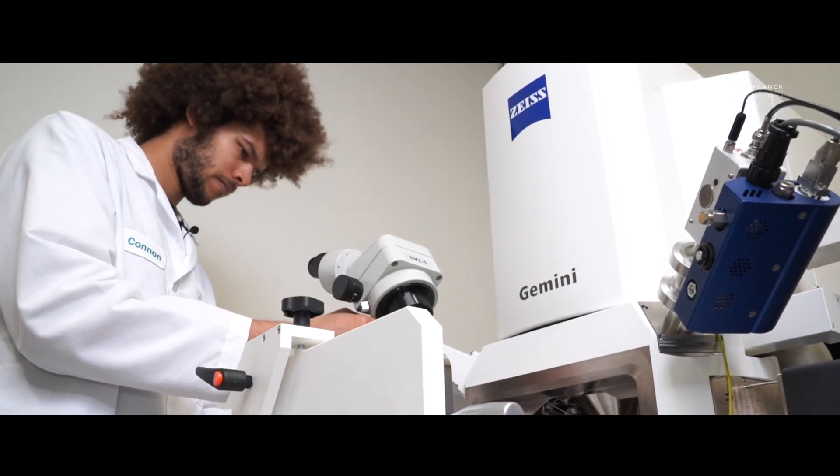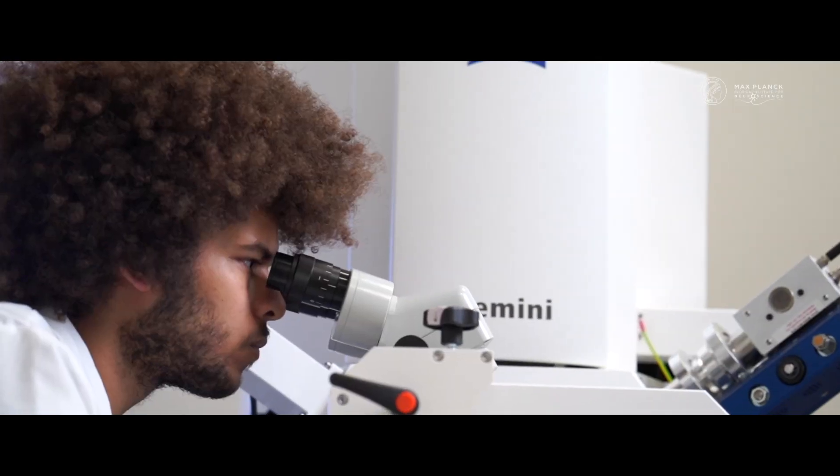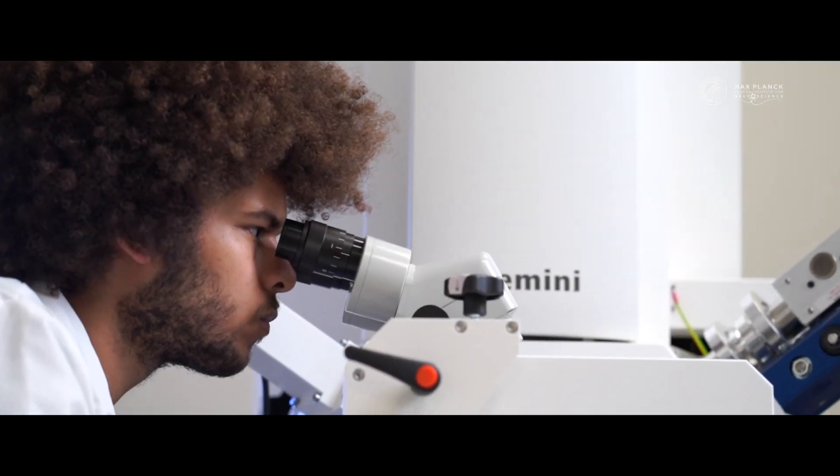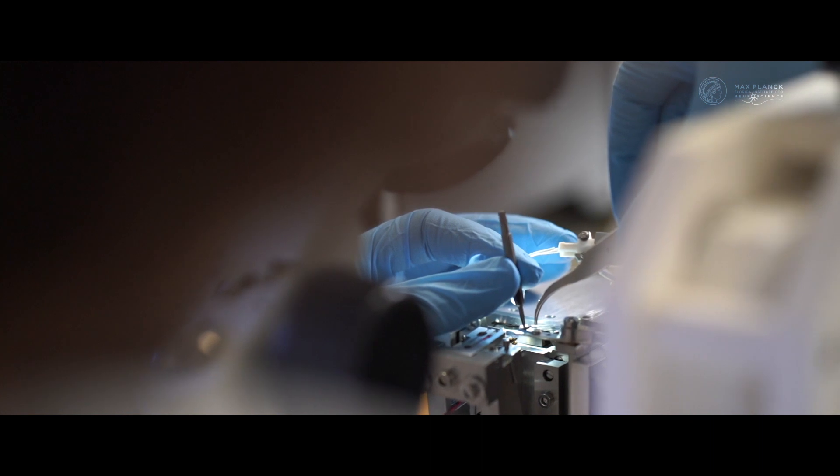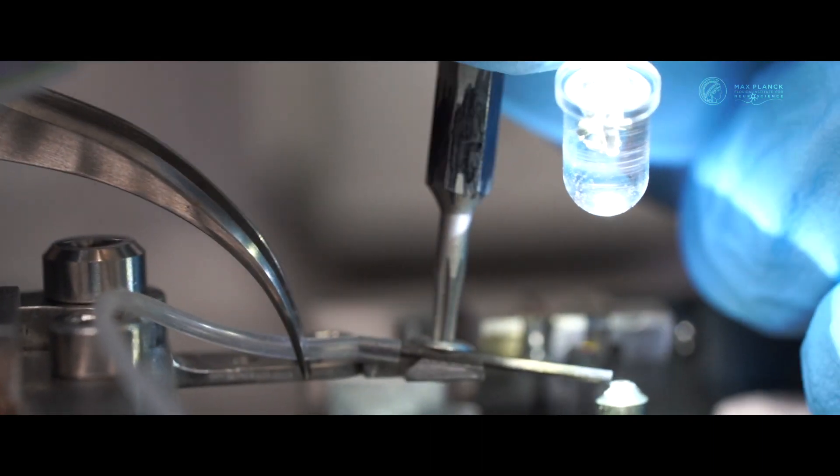We are currently using the Zeiss Gemini SEM along with the Gatan 3View system to perform serial block face imaging of large volumes of brain tissue.